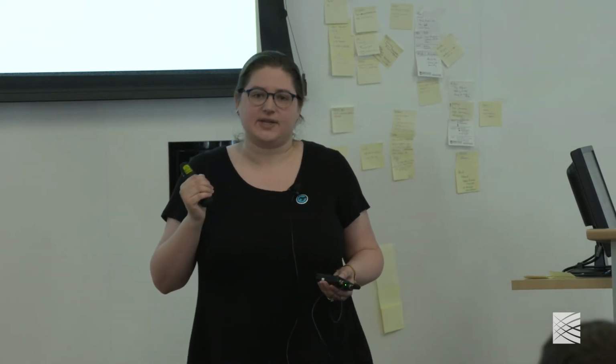If you were just trying to filter out common variants, you could use something like gnomAD. And we would recommend doing that, actually, especially if you don't have access to a panel of normals or a matched normal. But the panel of normals is really helpful for removing sequencing artifacts.